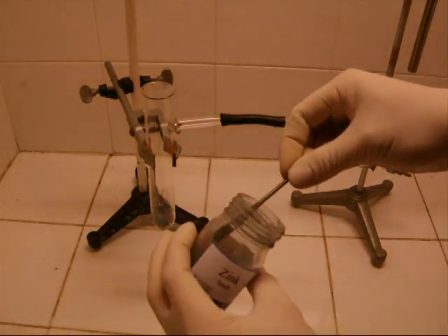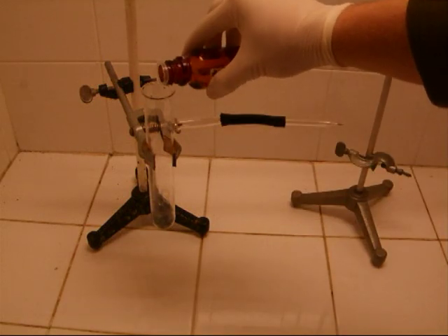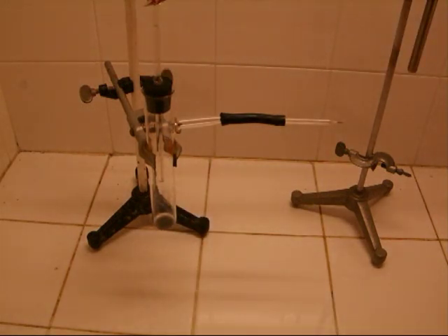At first, some zinc is added to the test tube. Then, the arsenic compound is added. Then, a stopper with a dripping funnel filled with hydrochloric acid is set onto the test tube.